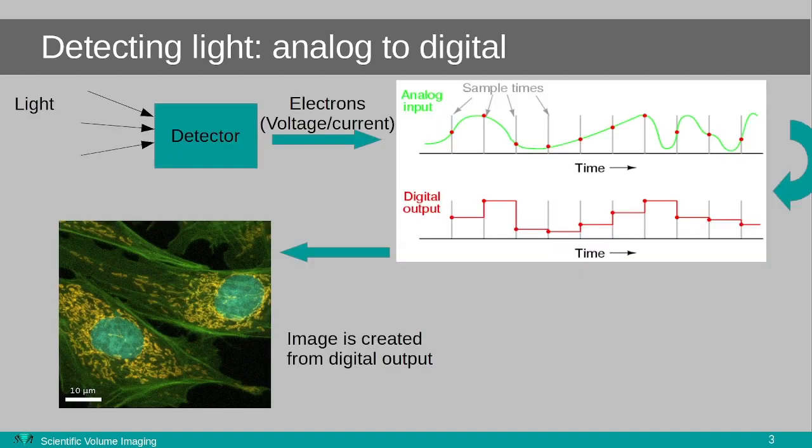As the excitation laser is moved across the sample, the detector keeps track of the intensity it captured at each specific point and writes that away to a file. When imaging multiple fluorophores, the same points are sampled again, with a possibly different excitation and emission wavelength, and the process is repeated. The file that your microscope then saves after the acquisition is a collection of these different intensities for all sampled points as collected by your microscope's detector.